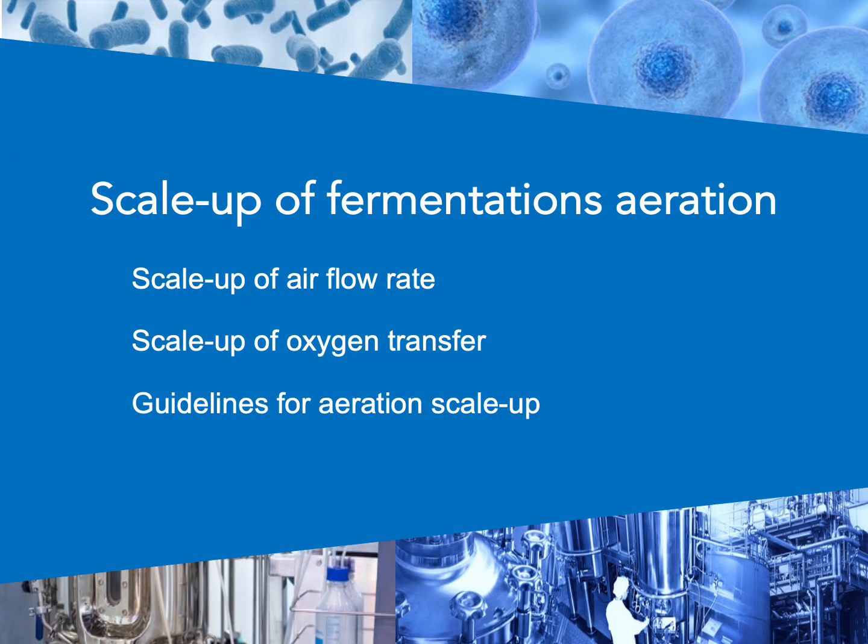In this tutorial, we address the following two key questions. How should the airflow rate be scaled up? What are the scale effects on the oxygen transfer process? Based on this analysis, we then propose practical guidelines for the scale-up of aeration systems in microbial fermenters.